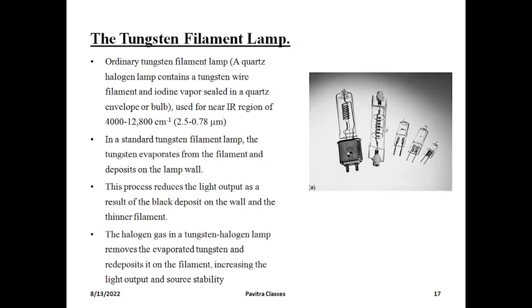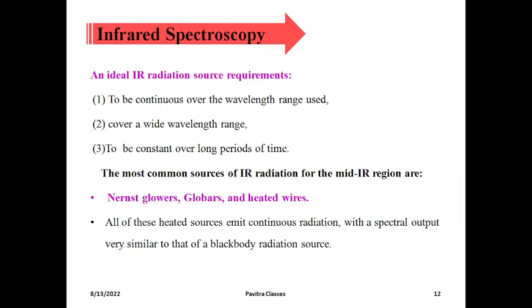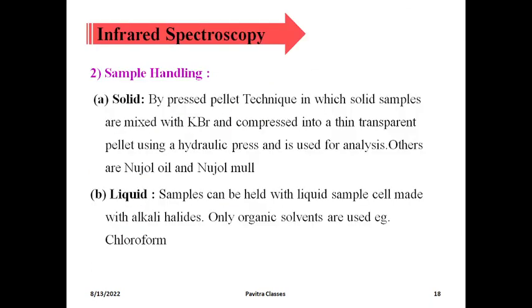This is about the sources of IR spectroscopy. These are rarely used sources now; now lasers are used as a source in IR spectroscopy. Next is the sample handling technique. Sample handling technique is very important in IR. It has two types: one is solid sample handling.